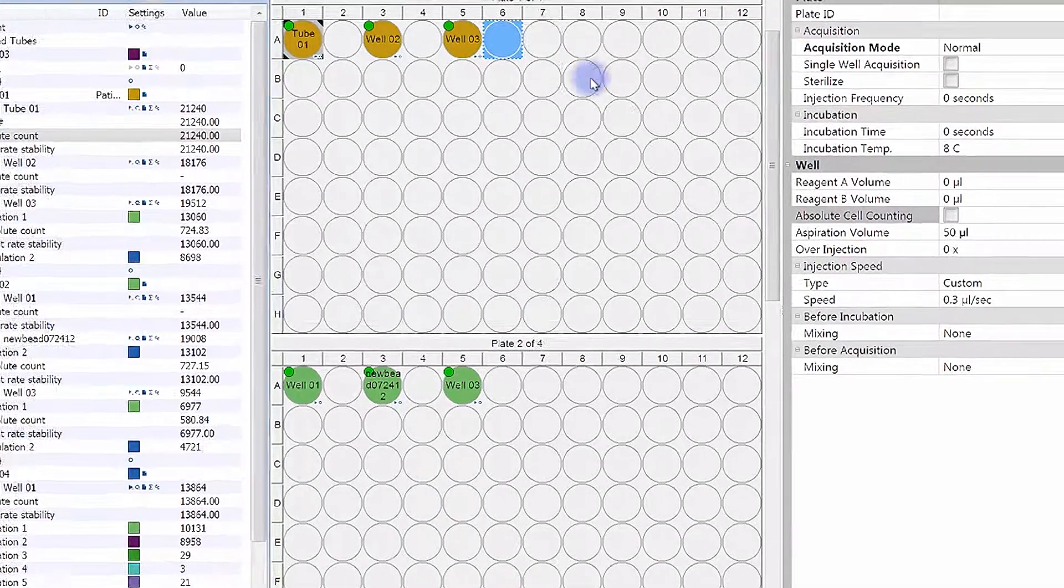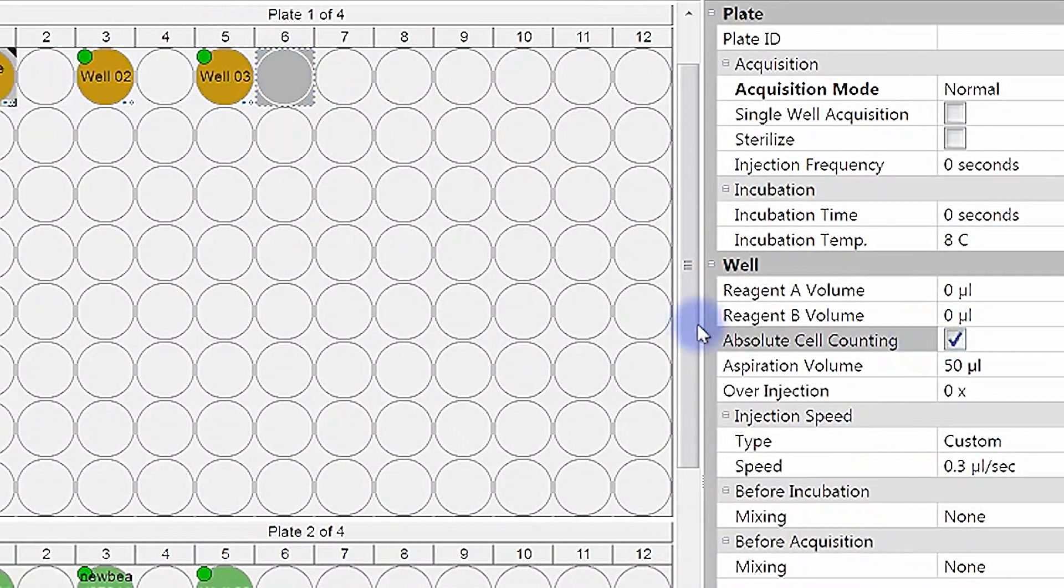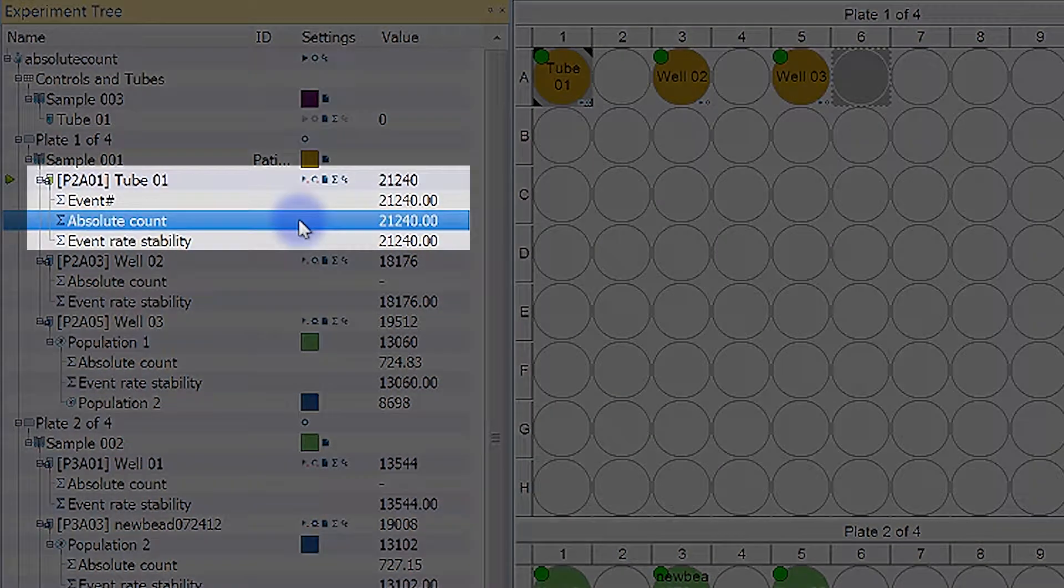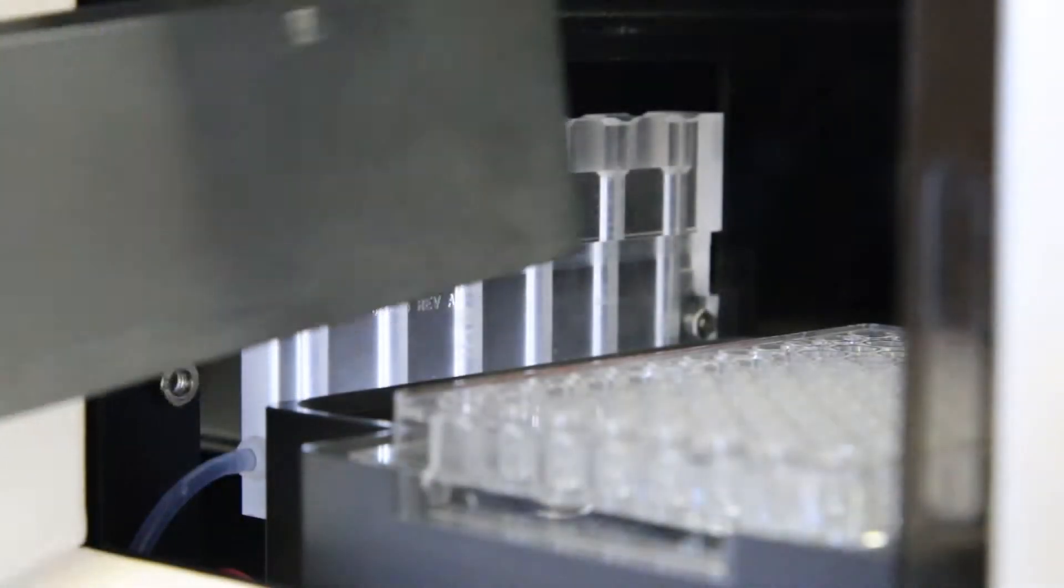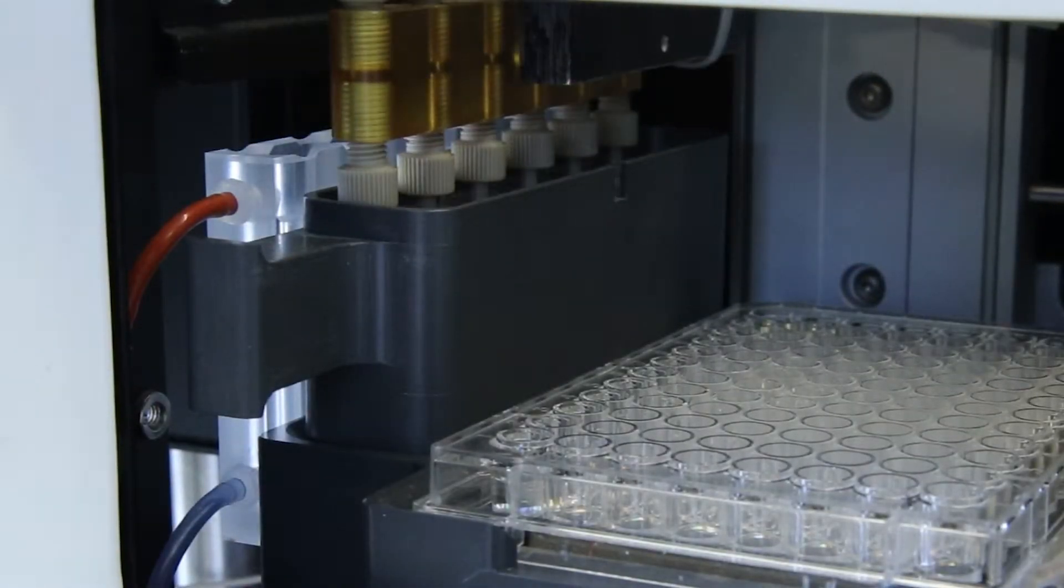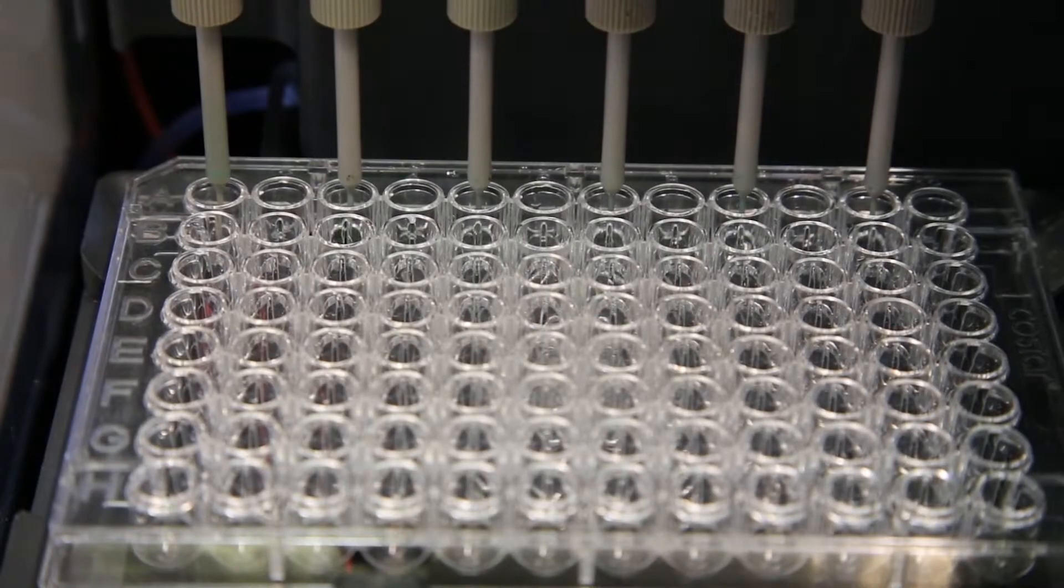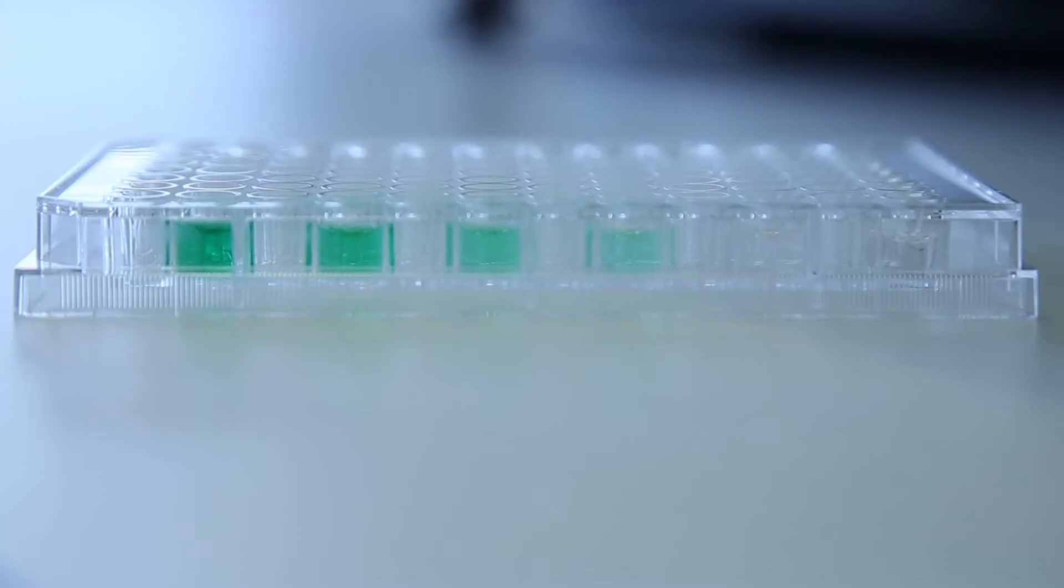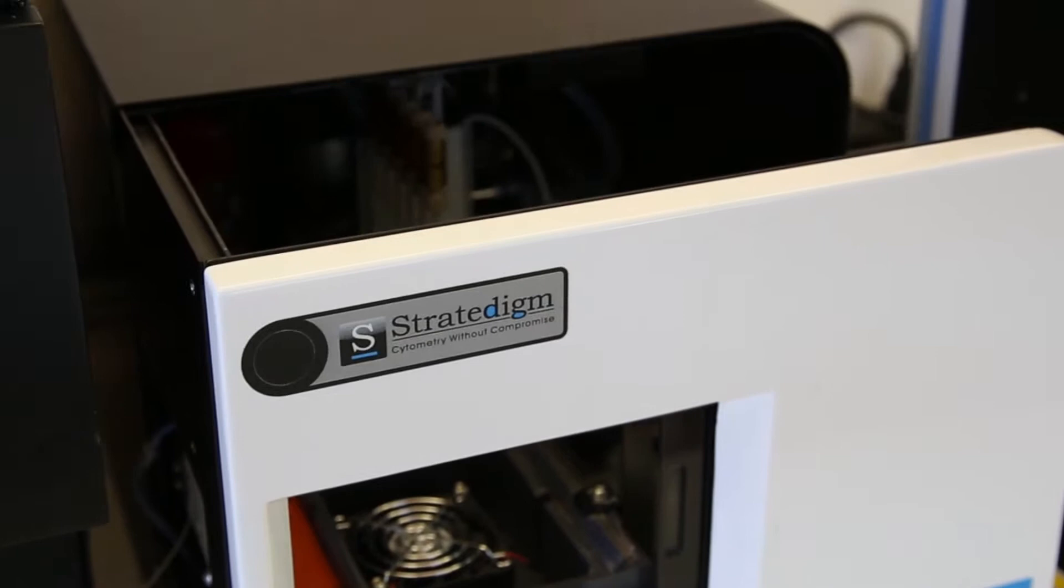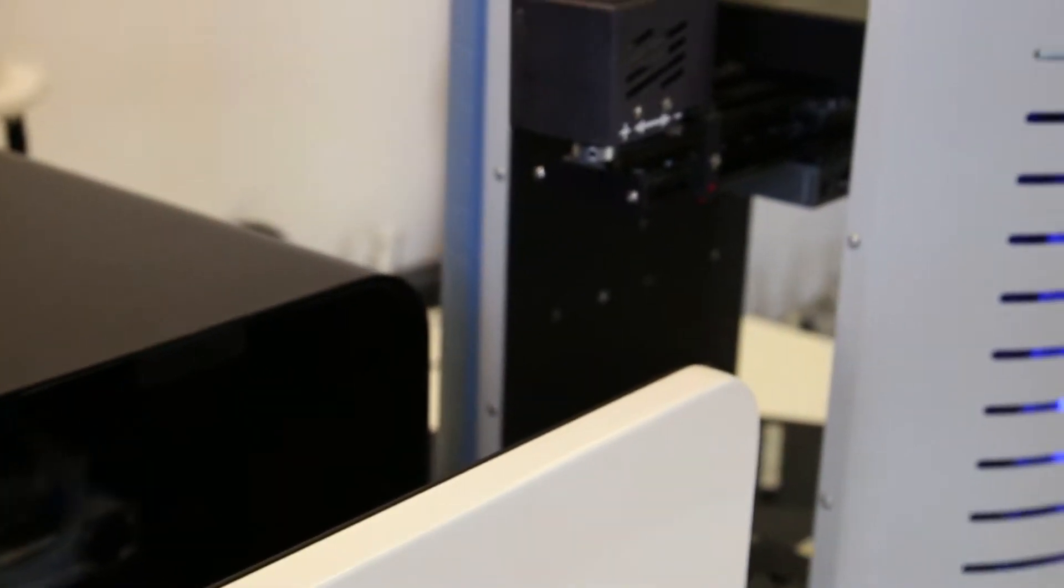It also comes standard with absolute cell counting, automated reagent mixing for titration studies, and at any time can be paired seamlessly with the A700 High Throughput Hotel, or HTH.